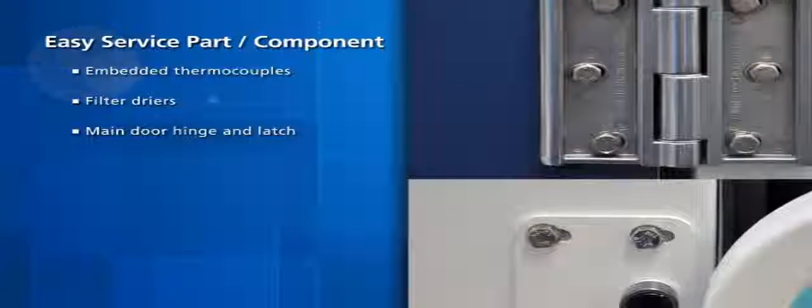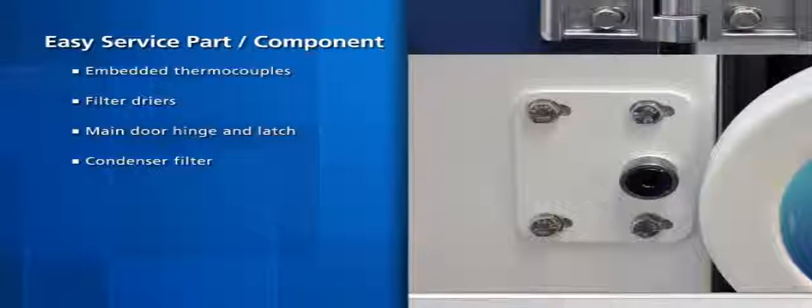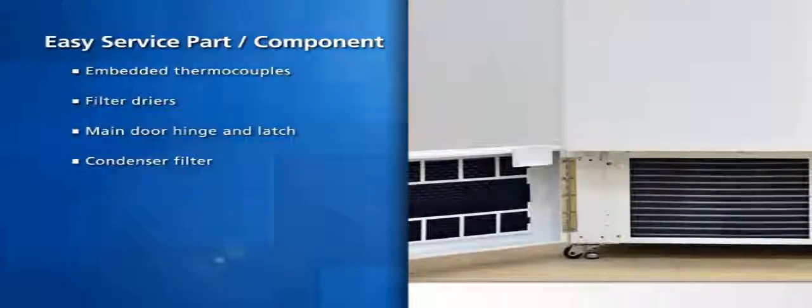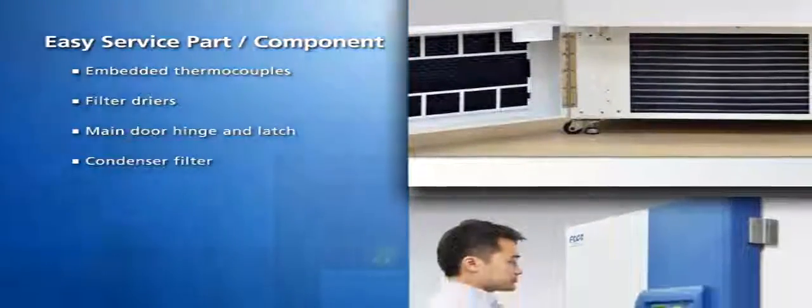Adjustable main door hinge and latch. Condenser filter is conveniently located at the front of the freezer. This allows easy access for inspection, cleaning and or changing.